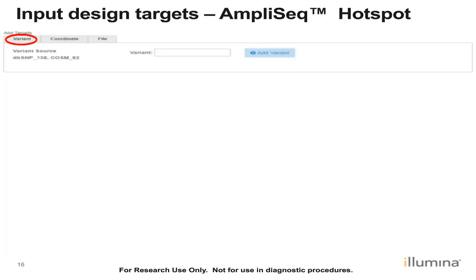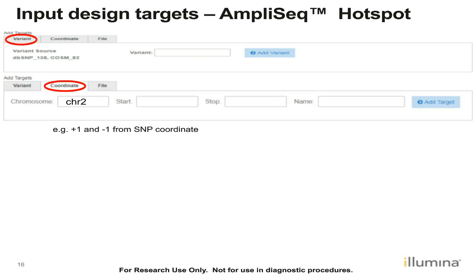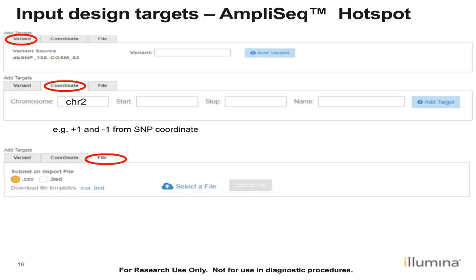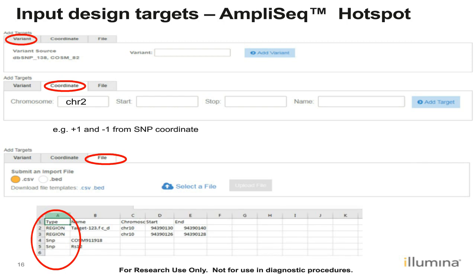For the AmpliSeq Hotspot panel, you can add variants. The nomenclature supports dbSNP IDs that can be added directly. You can also add coordinates — like for the AmpliSeq Gene design, you provide the chromosome name, start, and stop position, which would be plus and minus one from the SNP coordinates. Finally, you can add directly by file, either as CSV or BED format. The file format includes chromosome number with start and ending point, and you can also add SNPs or variants directly with several nomenclature examples supported.